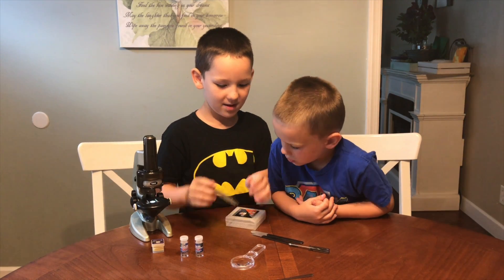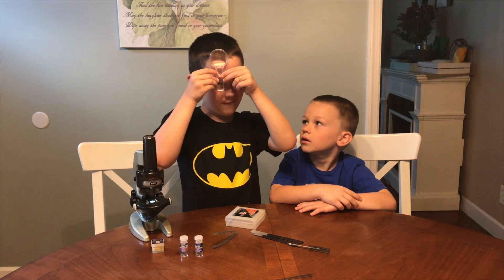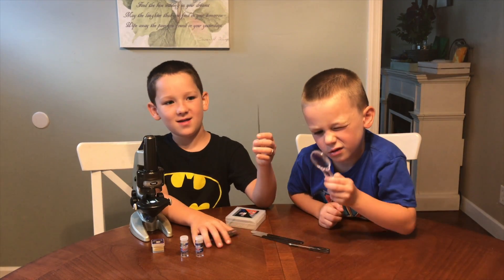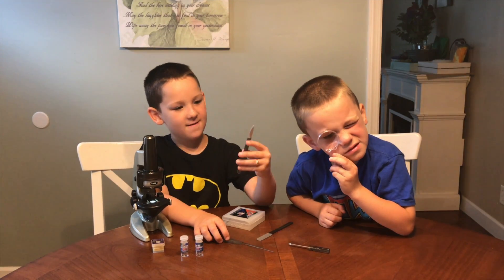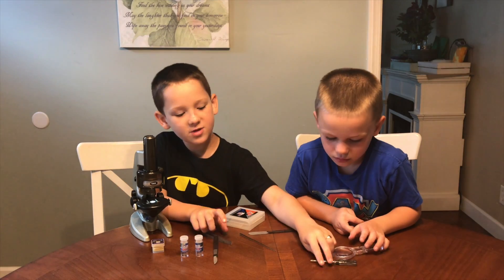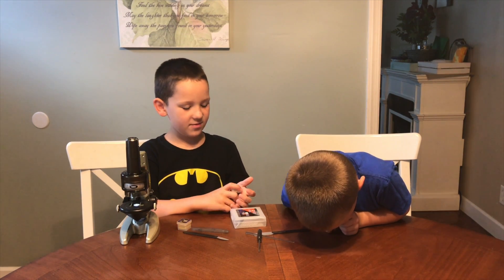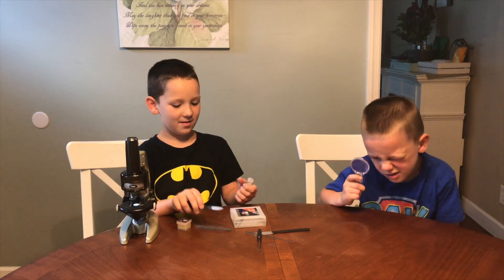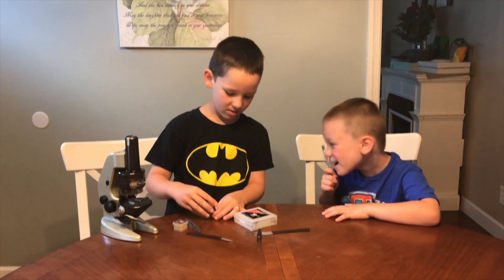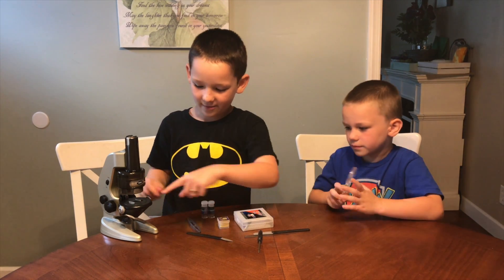And to help you use it with a slide, we have a spatula and a tweezers which I'm holding. We also have a magnifying glass. Then we have an eyedropper, and a knife which I think is for cutting up the stuff you want to look at so you have a little piece. The screwdriver was included to help install the batteries. Then we have two little collecting vials which you can take outside, cut off a piece, and put it inside with the tweezers. When you're done outside, you take the sample out of the collecting vial, then take a slide, and then it's all done and you can look at what you grabbed.